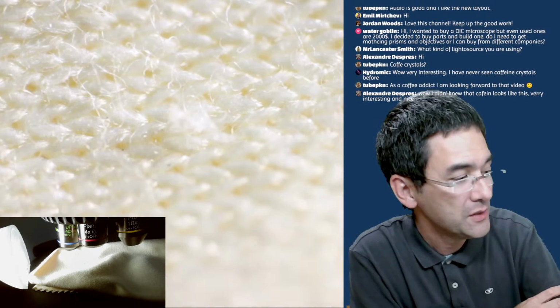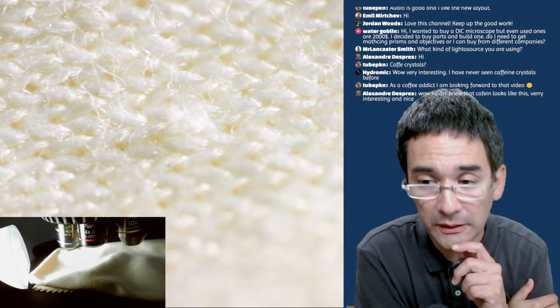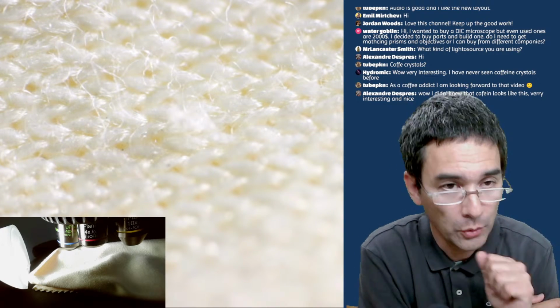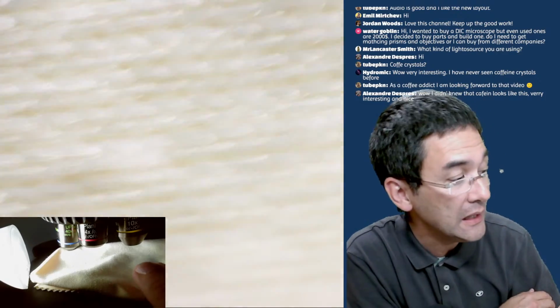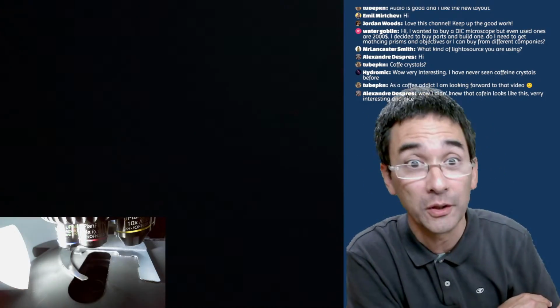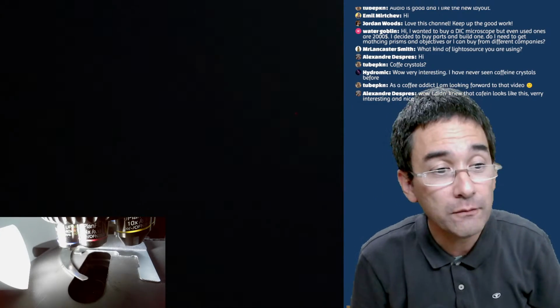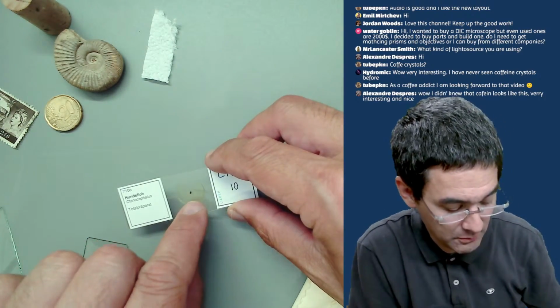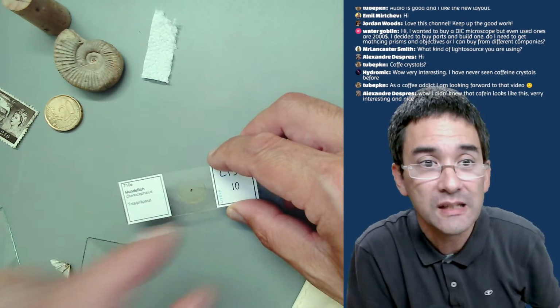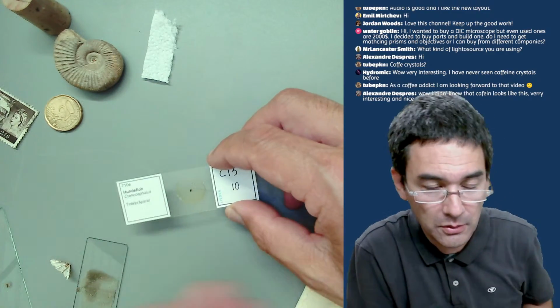So before I show you the rest, I want to show you a commercially prepared microscope slide with a transparent object, and I want to show you why it doesn't work. And then I'm going to show you a short workaround. This one over here is one of my favorite objects. It's a flea of a dog. So it's an insect, and they simply mounted this.